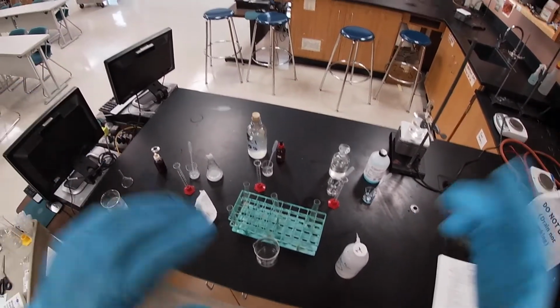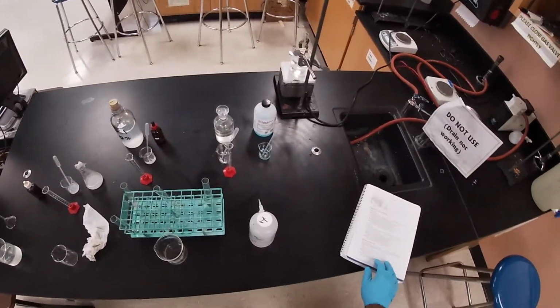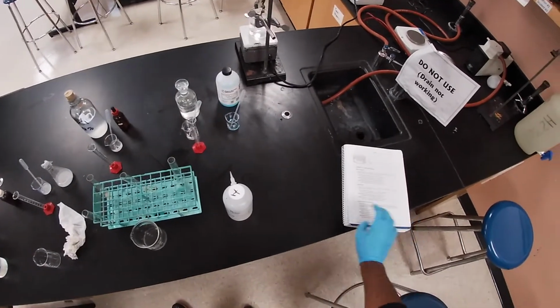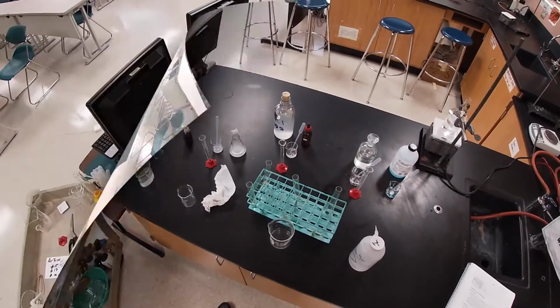Initially, and then after 30 minutes. I believe initially 30 minutes, and that's it. So let's go ahead and measure out.